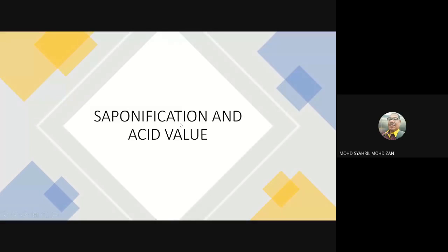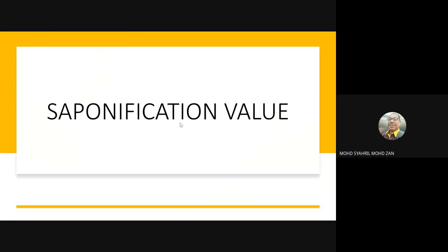Okay, this is what we call saponification and acid value, all about, all right? The info, the notes about the saponification. Since you don't have the time to do the practical, this is the best way to show you how the saponification and acid value methods are done. Okay, we go for the saponification value first.